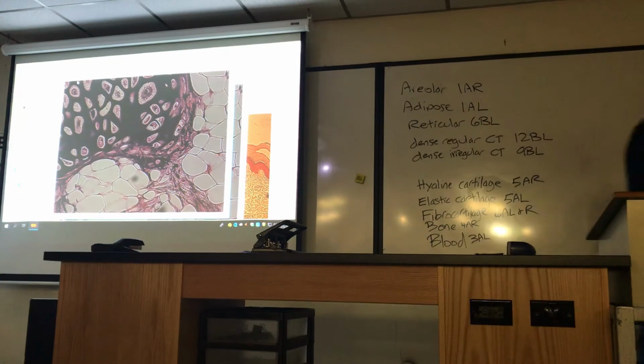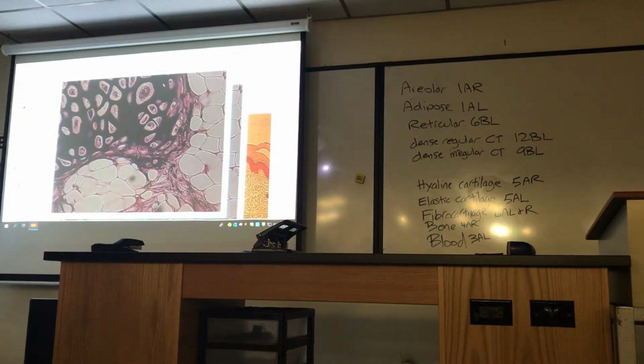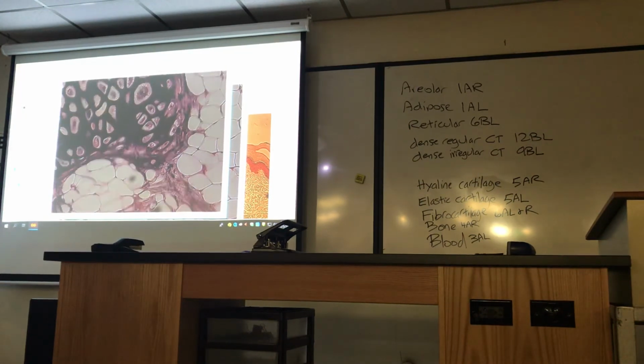Let's look at the stratified epithelium. Let's keep it at this mag. We'll just go to the top.